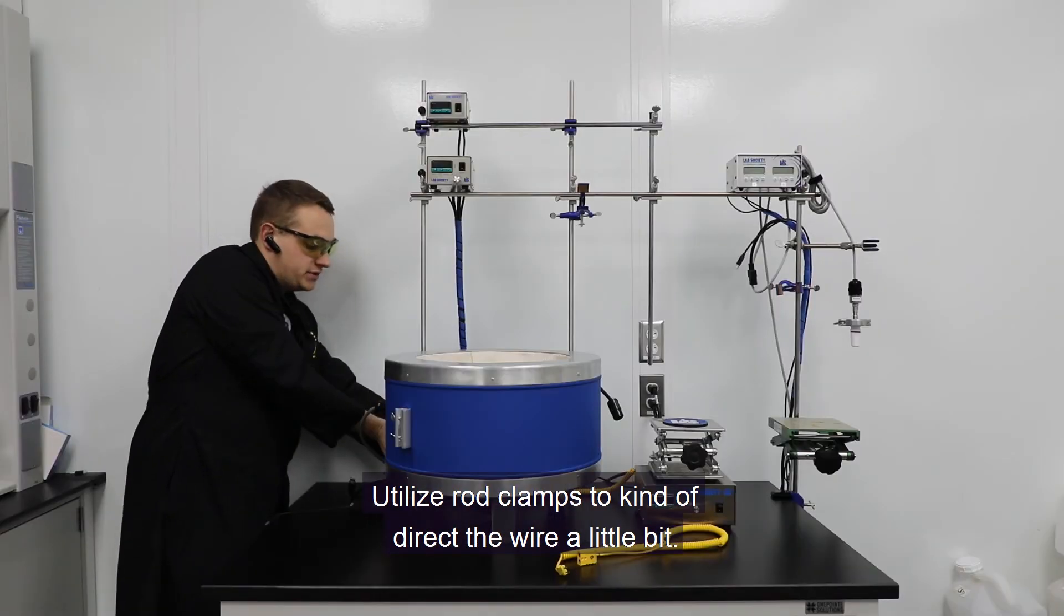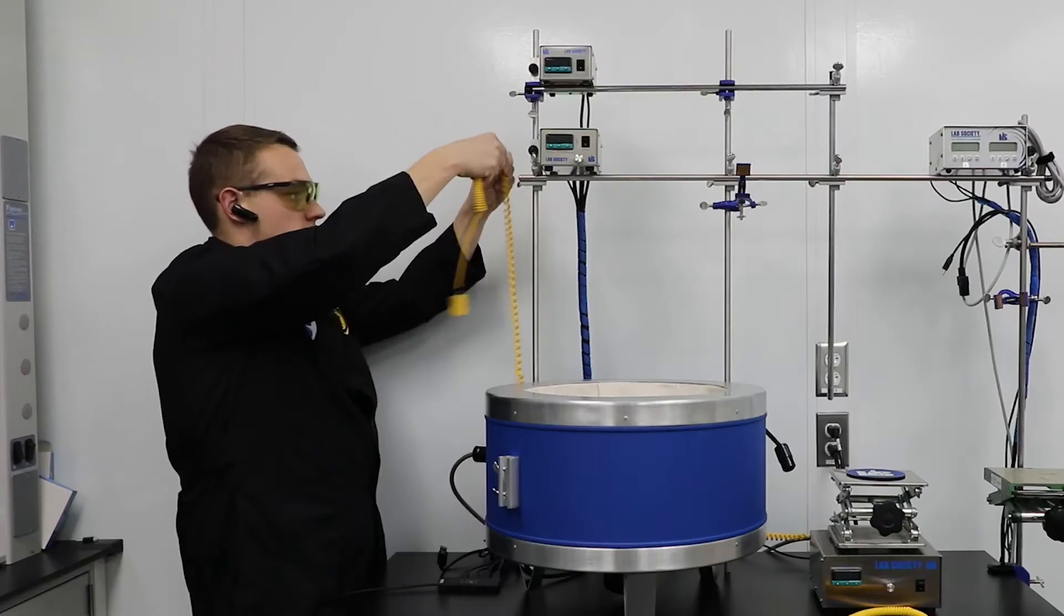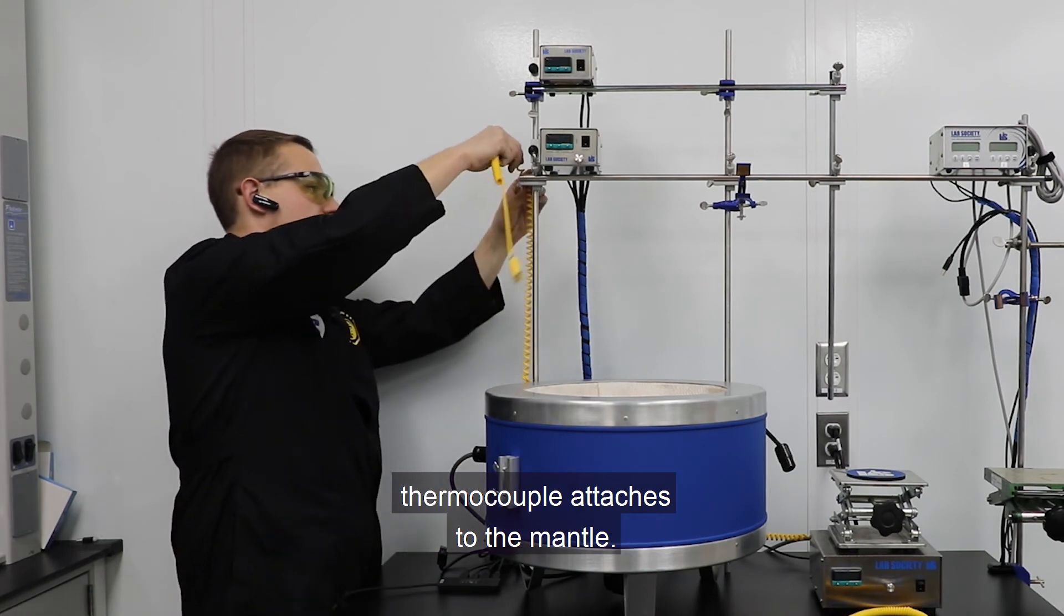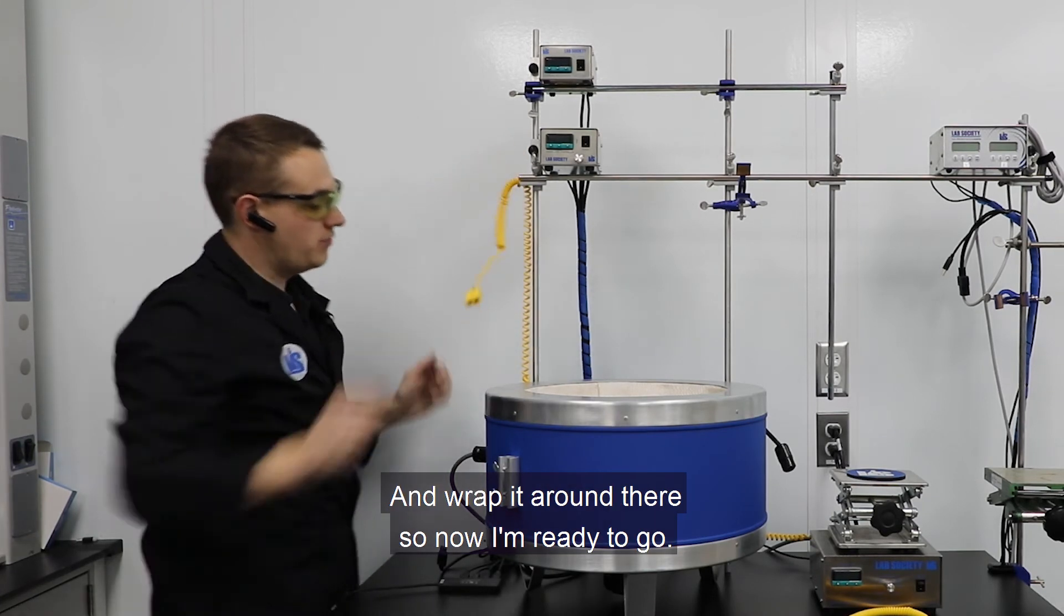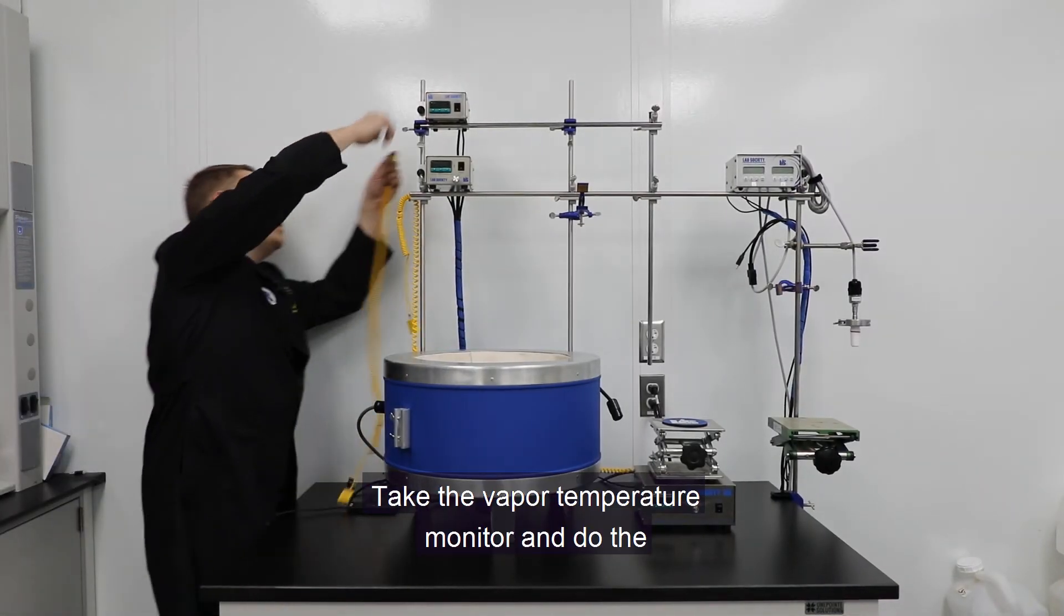Utilize the rod clamps to kind of direct the wire a little bit. And then to make sure there's no tension on where the thermocouple attaches to the mantle, I'm going to put it wrapped around there. So now I'm ready to go. And then for the vapor temperature monitor, I'm going to set it exactly.